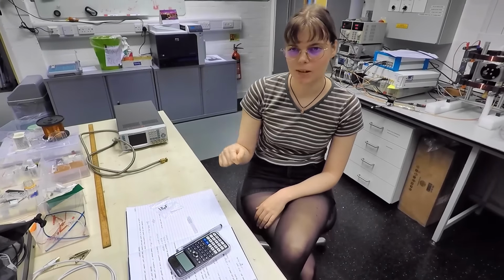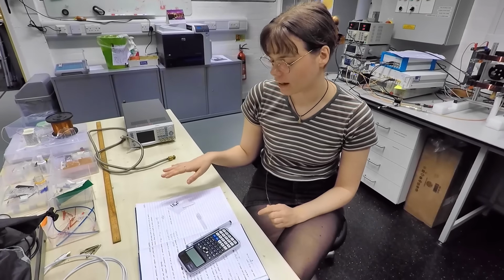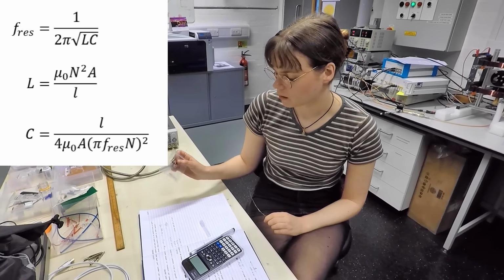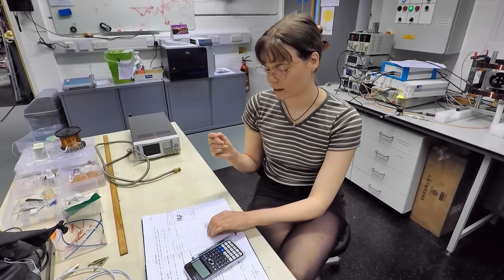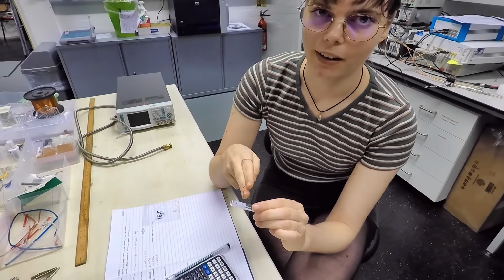Okay, so today I'm going to be making a solenoidal resonator. So the first thing we needed to do was calculate what capacitance we wanted, given that we have chosen a length of about 1 centimeter. So we calculated from the resonant frequency of an LC circuit and the inductance of a solenoid that we want about 35 picofarads, and I've got two 18 picofarad capacitors, so that'll give me 36, which is about correct. So then I can follow these 1 centimeter guidelines on this, wrap my wire around it, and then solder the capacitors on in a bit.